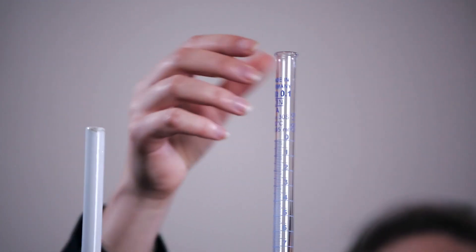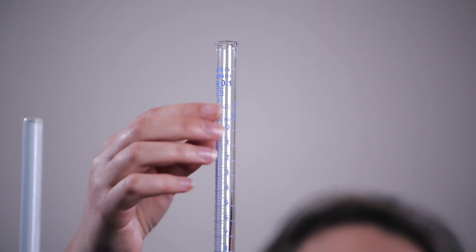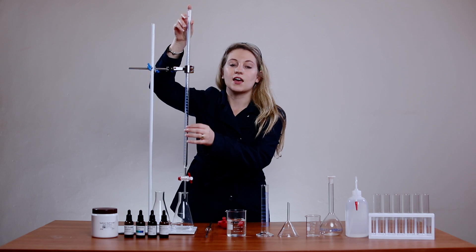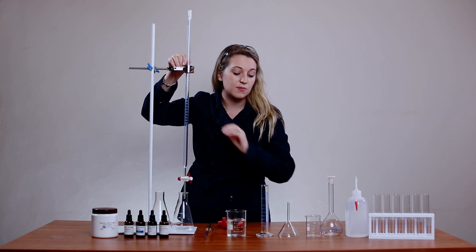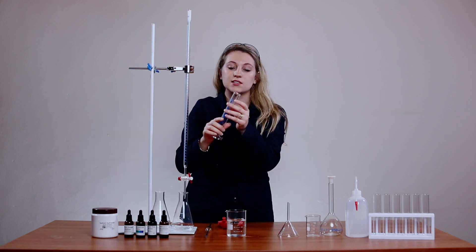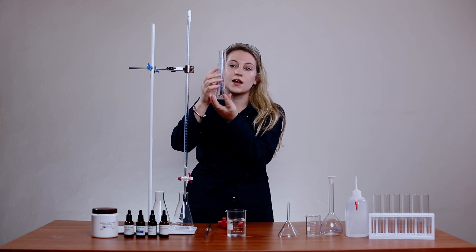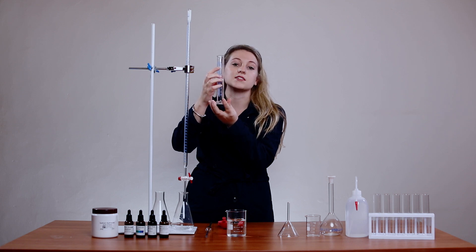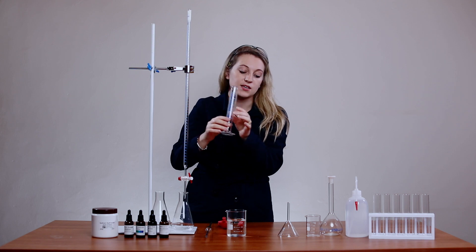On your burette you can see that on top here it says 0.05 milliliters plus minus, which means that your burette has an accuracy of two decimal places. If you compare that to a measuring cylinder which only has an accuracy of plus 0.5 milliliters, you can see the accuracy is only to one decimal place.